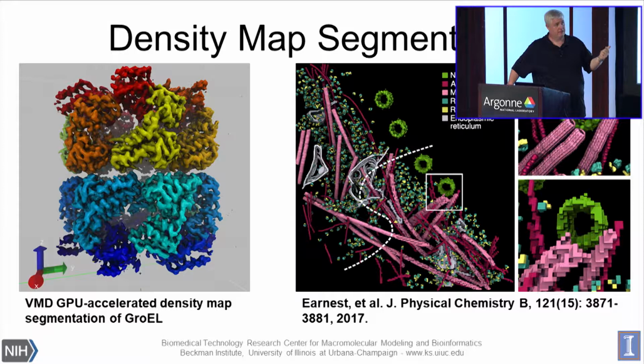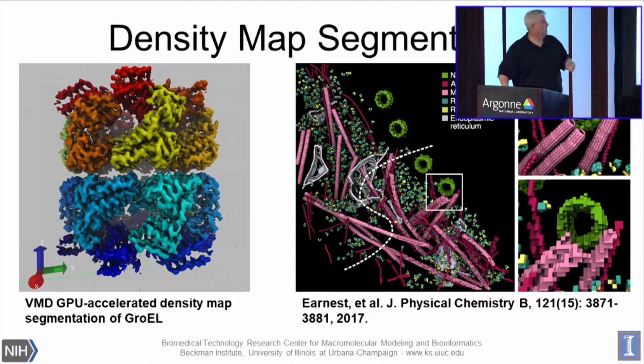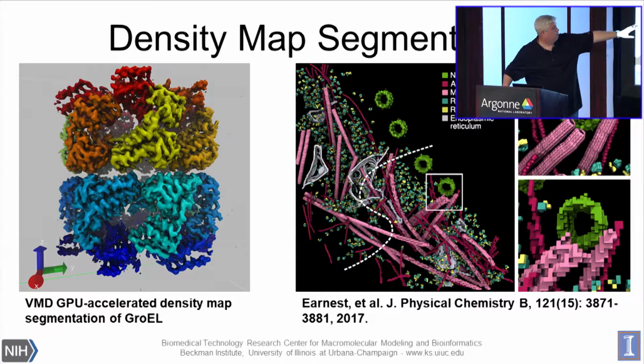So then I can apply different coloring to that part of the structure. I can use it as a selection. I can calculate various properties. And so we have a very fast image segmentation tool that works on these volumes. Going forward, we're applying the same thing to larger data, such as tomograms, and we want to be able to do things like fitting different high-resolution cryo-EM data to lower-resolution tomograms using some of these techniques. The math behind some of them is very closely related.